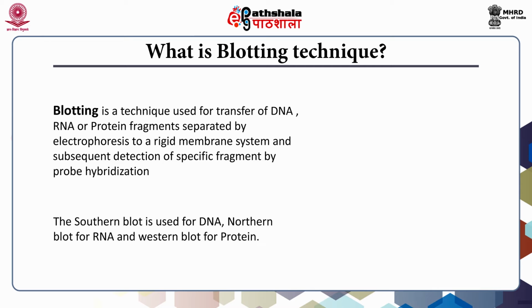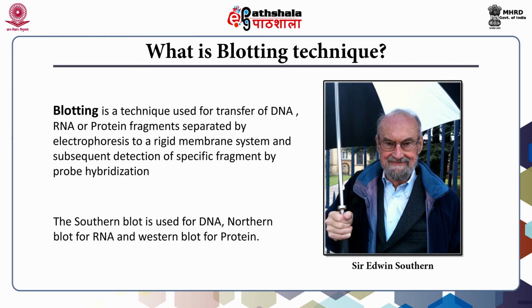Blotting was developed initially for DNA by Sir Edwin Southern, and the technique was named after its inventor as Southern blotting. Other blotting techniques developed for RNA or protein on the same principle were named conventionally as analogs of it: Northern blot for RNA and Western blot for protein.